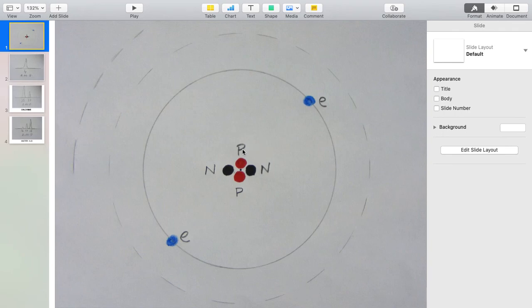The one I've made is not one using magnetic deflection. This one is what's known as a quadrupole mass spectrometer. These are the most common ones in industry. A quadrupole mass spectrometer doesn't need quite such a high vacuum. That's one of the reasons I've used this technique. A quadrupole mass spectrometer can't give a very high resolution mass spectrum. That has to be done with a magnetic separating mass spectrometer, which has something known as double focusing to get a precise measurement of the mass.